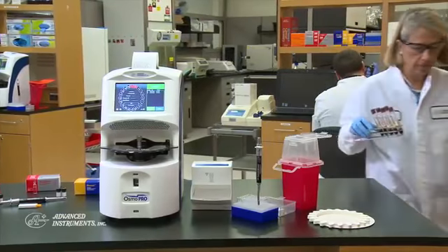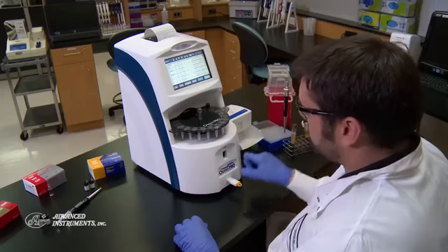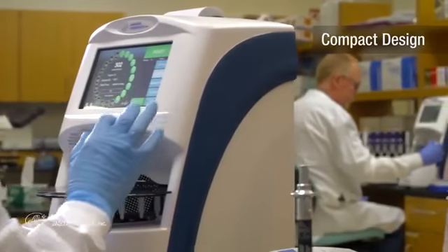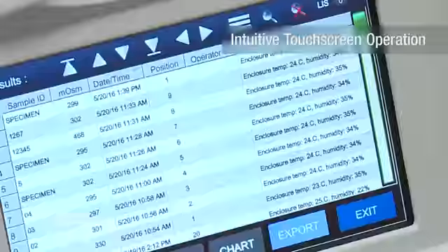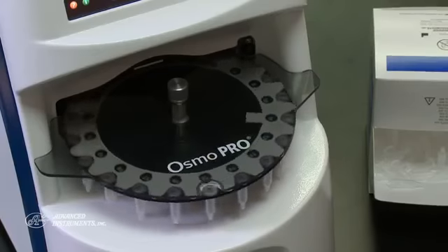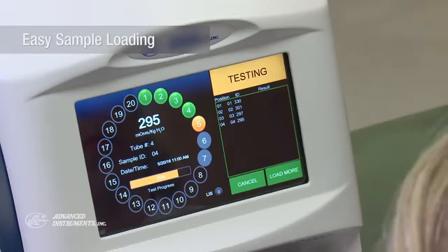With OsmoPro, you can be confident and efficient. Let's see how easy it is to use. The small footprint is perfect for any size laboratory. OsmoPro is easy to operate thanks to the intuitive touch screen display and the menu-driven user interface. The 20-position carousel design allows for easy sample loading and multi-sample batch processing.